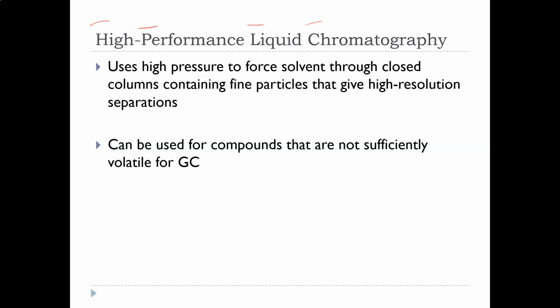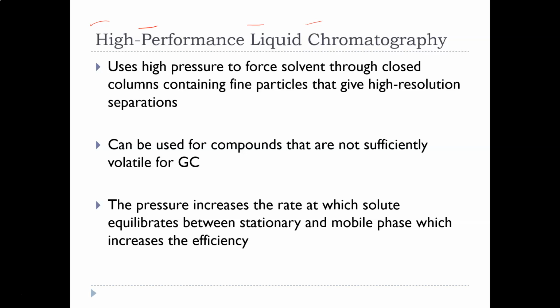So what happens in this is, the stationary phase is a packed column. So it's typically using adsorption chromatography, but it could be ion exchange, it could be molecular exclusion, but a packed column. And so the stationary phase is a solid, and the mobile phase is going to be a liquid, and that liquid will be whatever the solvent is, and it can vary throughout the course of the experiment. Like it might be that it's 60% acetic acid, 40% sodium acetate is the mobile phase, and then as the experiment moves on, they have the computer set up to vary it to where it subtly shifts to become 100% acetic acid or something. But that'll be for you instrumental analysis people to deal with.